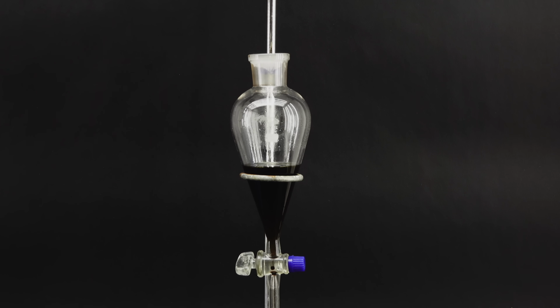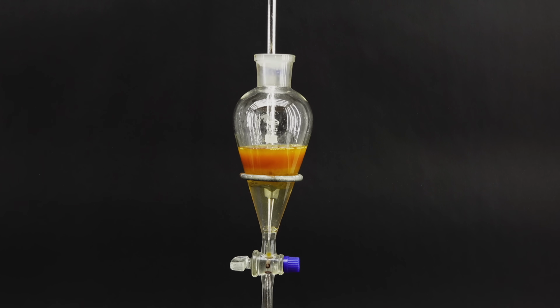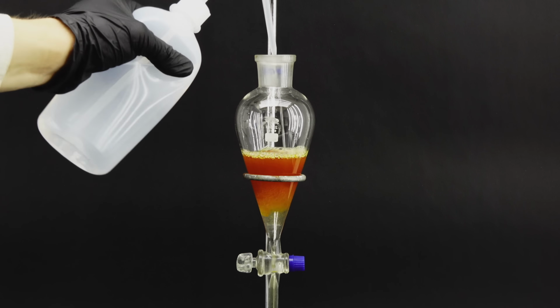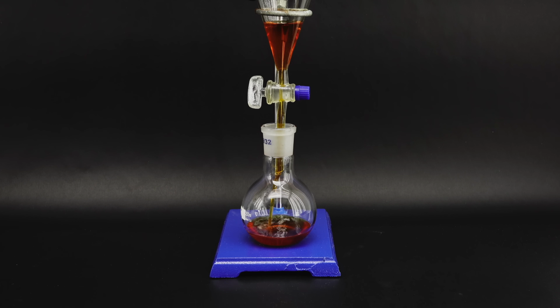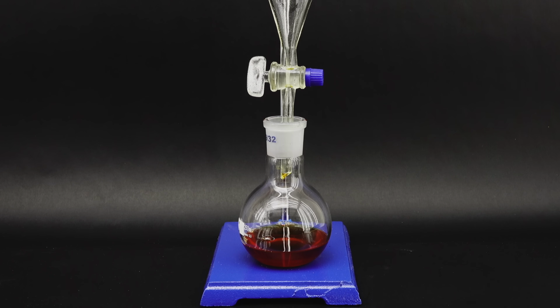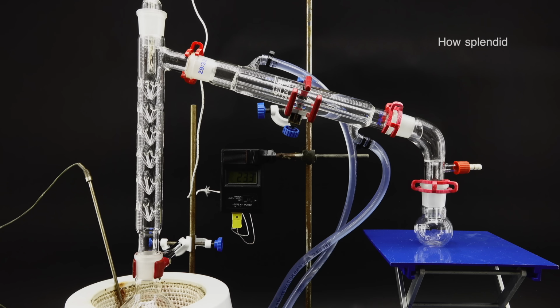To try and make the benzene a little more transparent, I washed it with some distilled water, which seemed to really do the trick. I then washed it with a dilute sodium hydroxide solution, then again with some distilled water, and finally with some brine to dry it. After draining off my washed benzene, it honestly looked worse than before, however, on a chemical level, it was much purer and virtually water-free. The final thing I need to do to purify it is, you guessed it, fractional distillation.